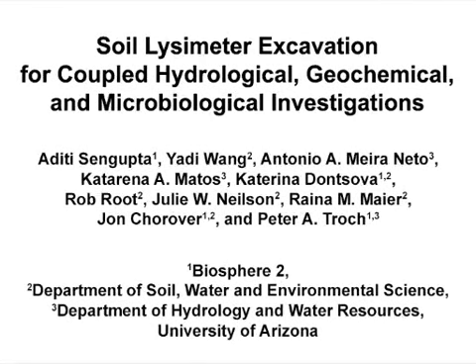Studying coevolution of hydrological and biogeochemical processes in the subsurface of natural landscapes can enhance the understanding of coupled Earth system processes. The overall goal of this method is to excavate a soil lysimeter to understand subsurface hydrological, geochemical, and microbiological heterogeneity.